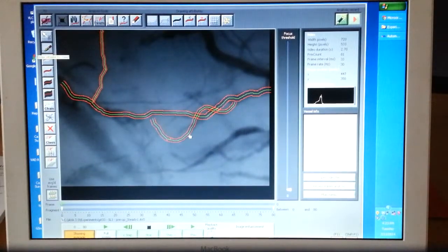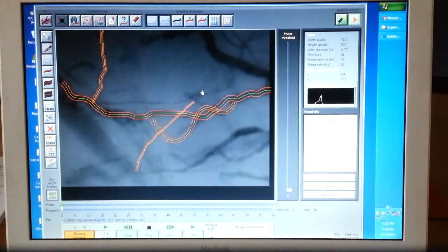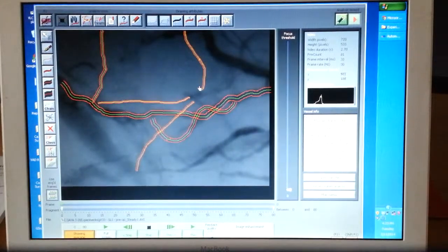So let's say we do some more drawing. We draw all the way here. This is a very thin one. And then we draw this one up here. Again, very thin. And then we draw some more, very thin. Okay, we've made a little bit of progress. Obviously, I haven't made that much, but you can decide how much you want to do before saving it.